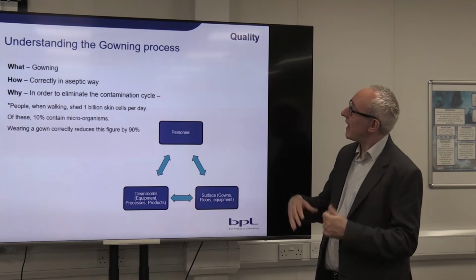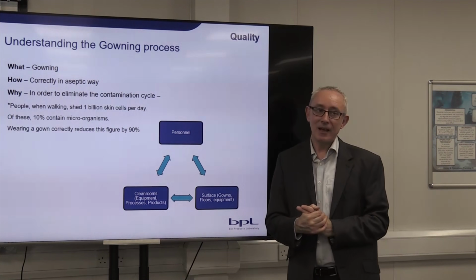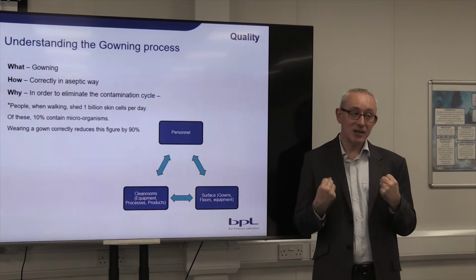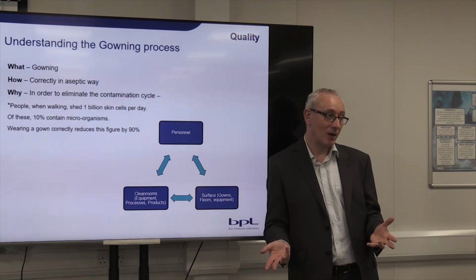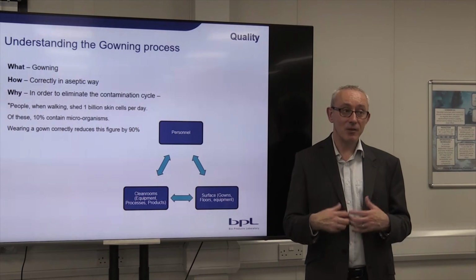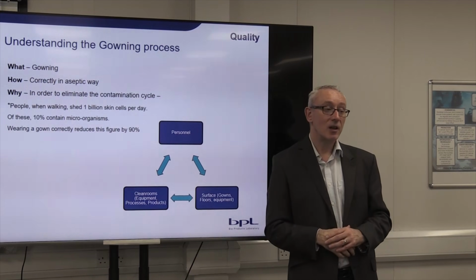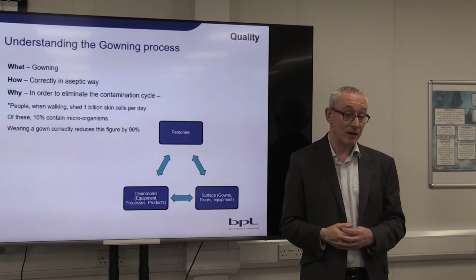Okay, so gowning is again a fine art, and it is a little bit of an alien concept, particularly if you're working in the aseptic filling suite. So practicing gowning is really important. As new joiners to BPL, any opportunity you can get to practice gowning, the better. For both areas, for C and D and for the aseptic filling suite, you need to show a trainer that you can get gowned correctly.